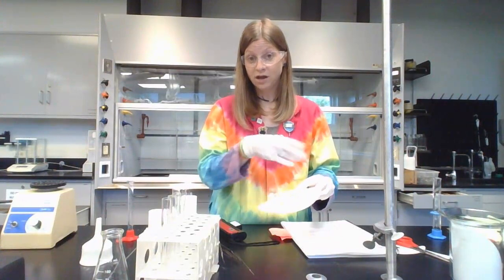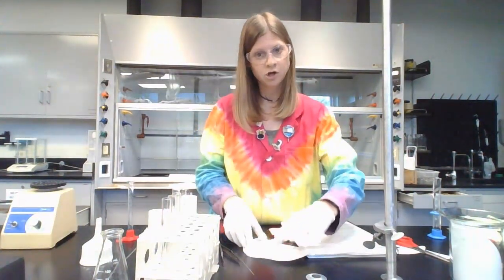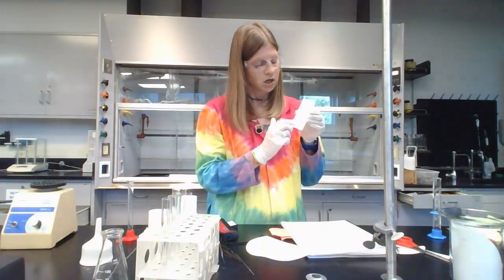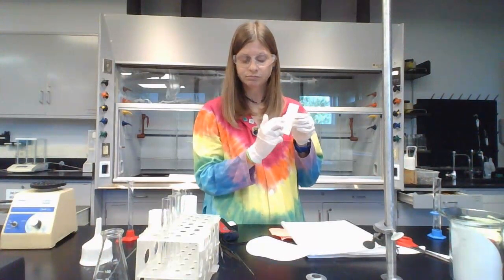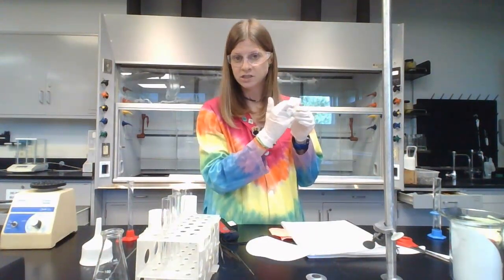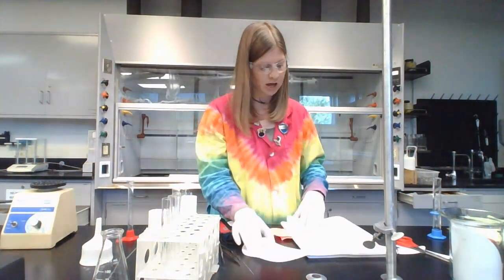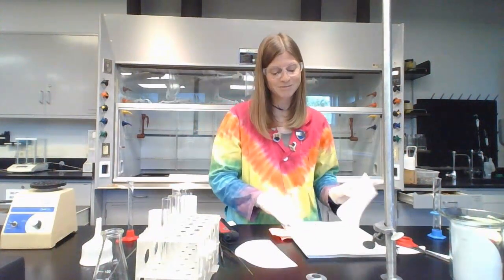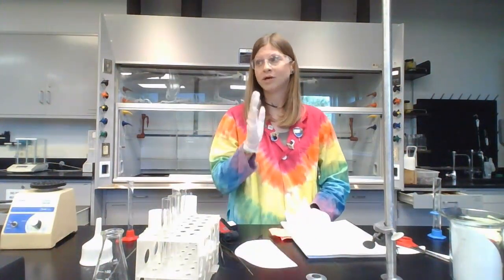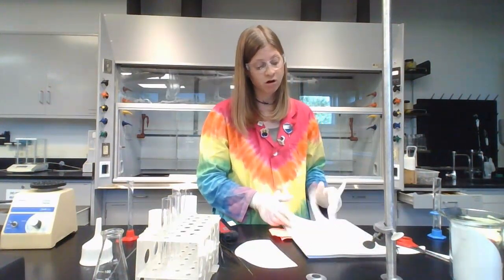Once you've circled everything and you took note of what they look like under the UV light, you're going to grab a ruler and measure the distance from the starting line, which was the line that you drew, to the middle of each spot. And then also one time from the starting line to the solvent line, which is the top line from where, not the very top of the thing, but where you drew your line when you took it out. Okay, so you'll record those in millimeters, which means, again, read the ruler correctly, write down everything you know for sure, and then one place past that, and then you'll be calculating the RF value from that.